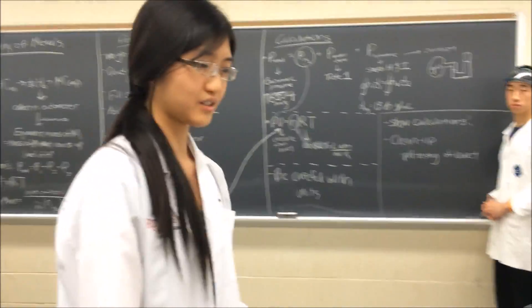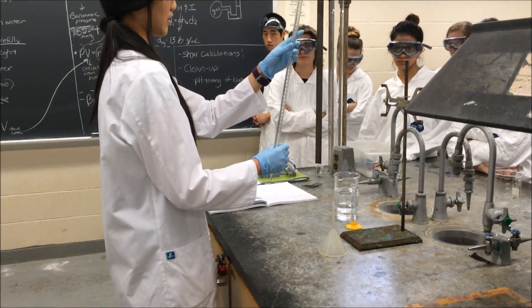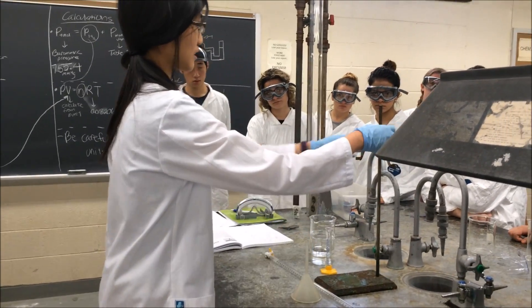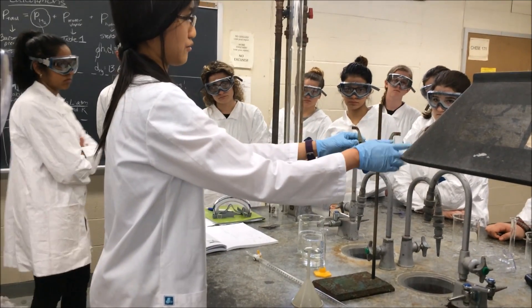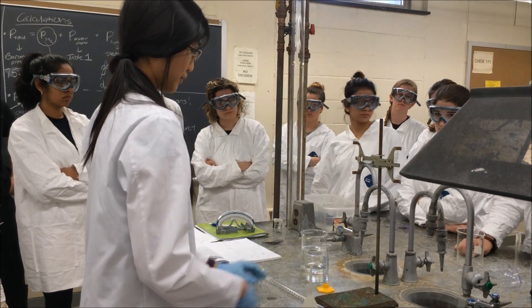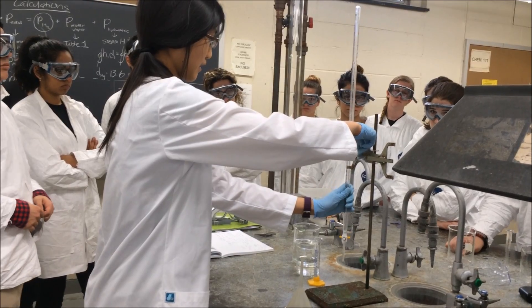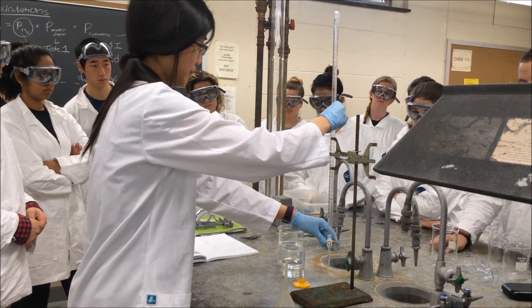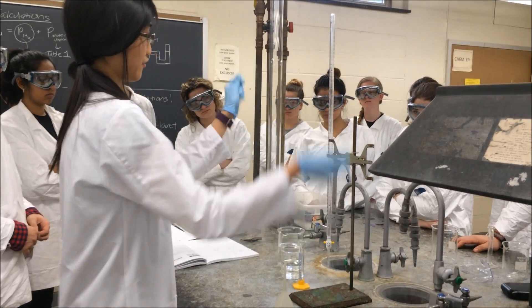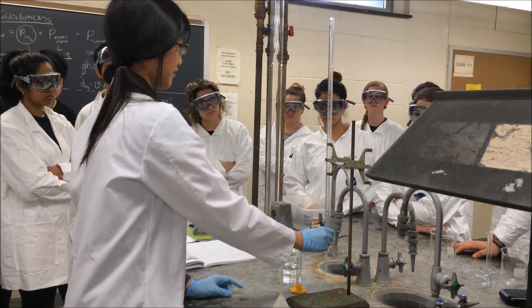Now to set up the eudiometer. First, we're going to put it right side up. This is a burette clamp — please make sure you attach it through the middle and not through the side; it's a lot more stable. Then we're going to take a burette and set it up as usual. We do this because we want to find the volume at the top portion — we're going to eventually flip it upside down, so this end will be on top, but there are no markings there.